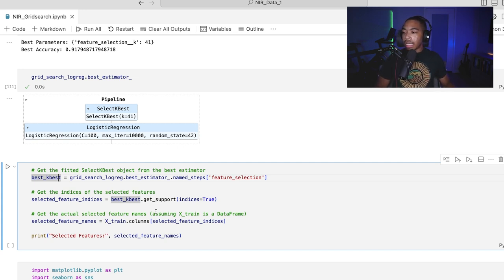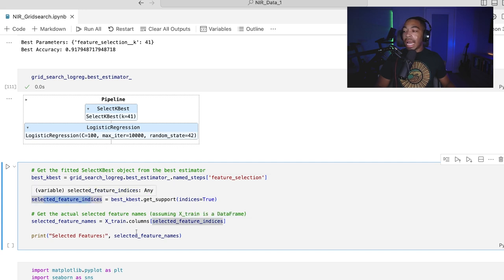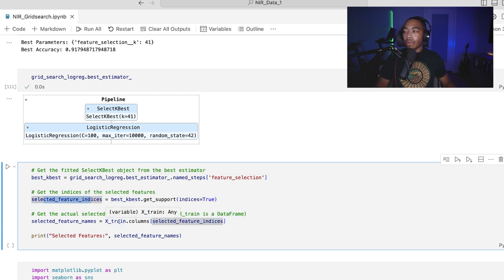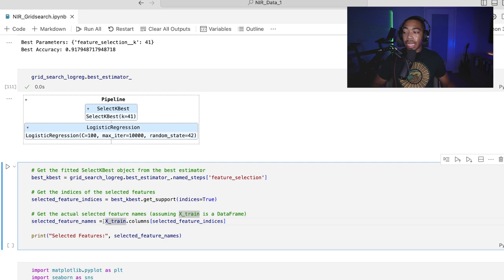In the next set of lines, we're going to then take that selected feature indices and get the actual names of those columns. So here, we're going to get a list of index values. And now we're going to get those column names, and we're going to store that as selected feature names.